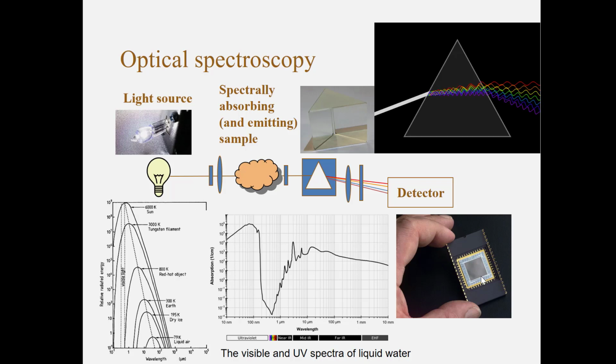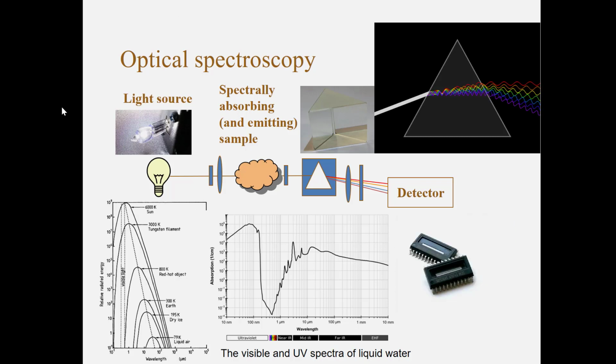And since 2D detectors are used for image acquisition, they are very common. But there are also 1D detectors. So that means here we have a row of detectors, and some types of detectors which exist in a row like this have some properties which make them good for spectroscopy, so they are also used.